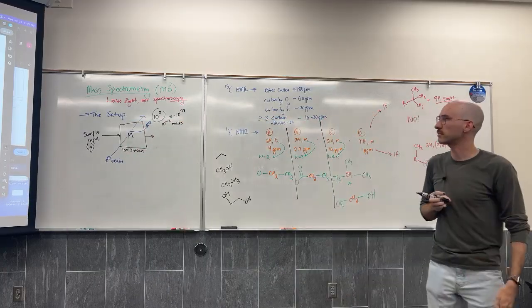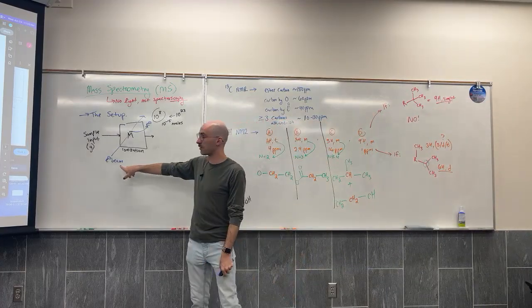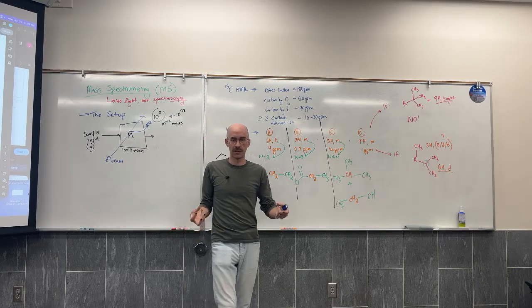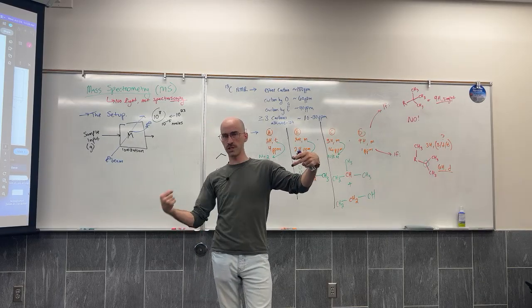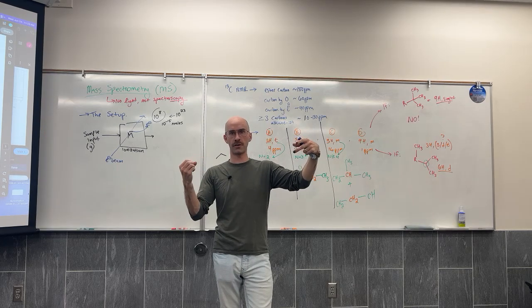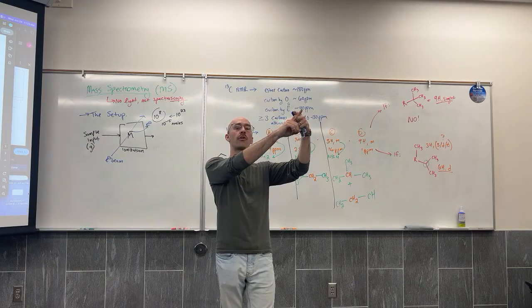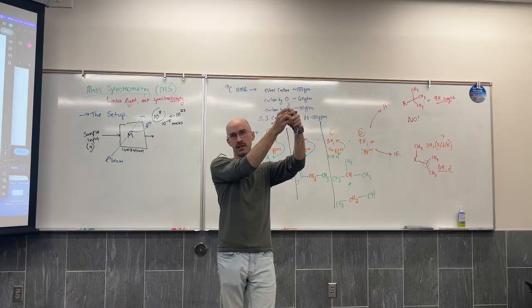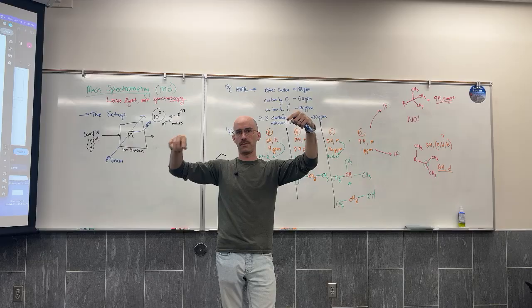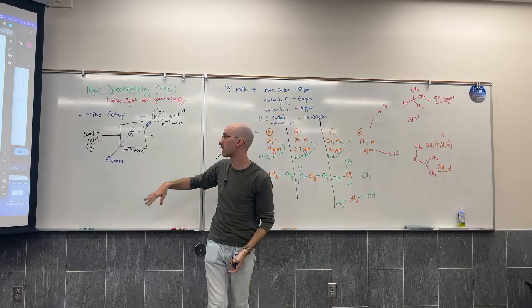Well, what happens to ejected electrons? Do you just find a new home or something? Well, that's a good question. What about the beam of electrons? Where are they going? How do you even generate a beam of electrons? So we've got a part of our instrument here that pushes energy into a metal sample that can then eject those electrons because of that high energy. And those electrons are being pulled towards another part of the instrument that accepts electrons. And then, of course, the energy from those accepted electrons, we can create a cycle here. So those ejected electrons are going to go to the same place that the electron beam goes to.